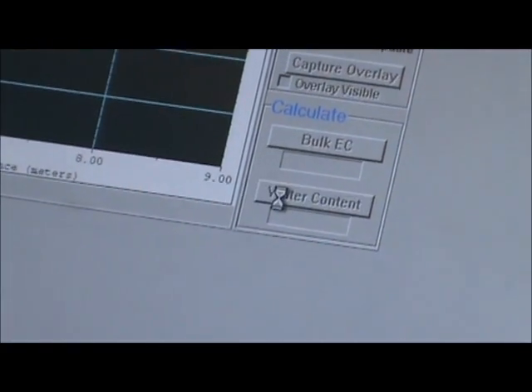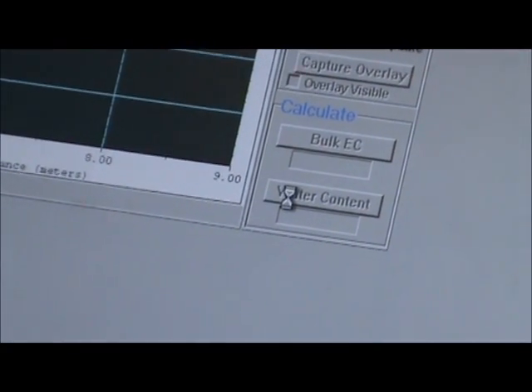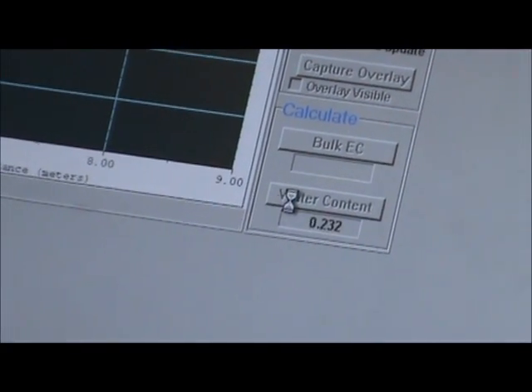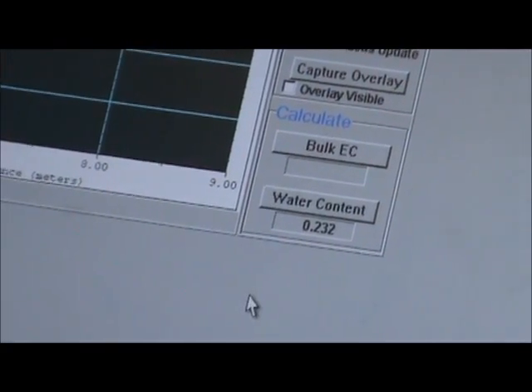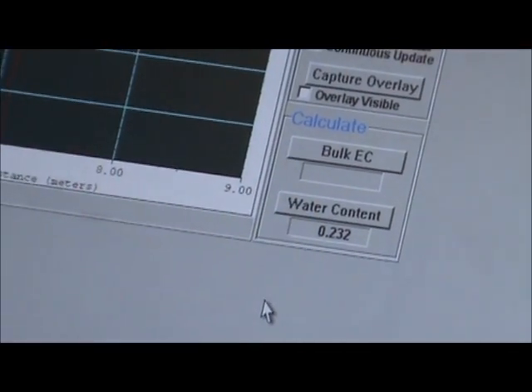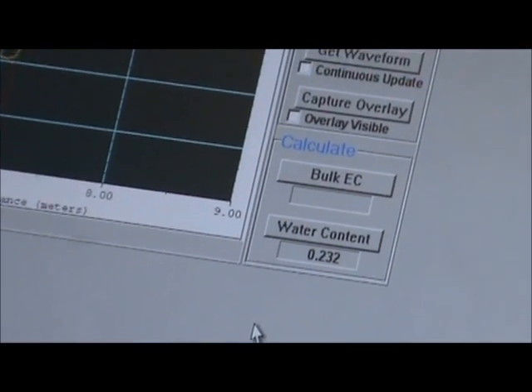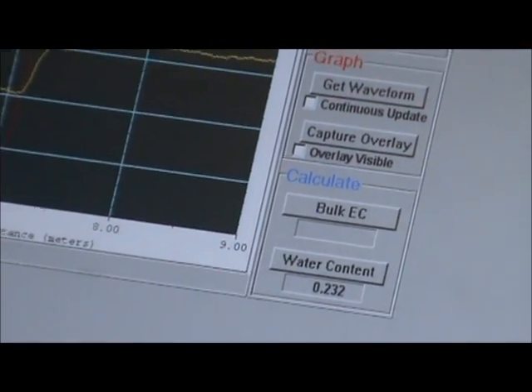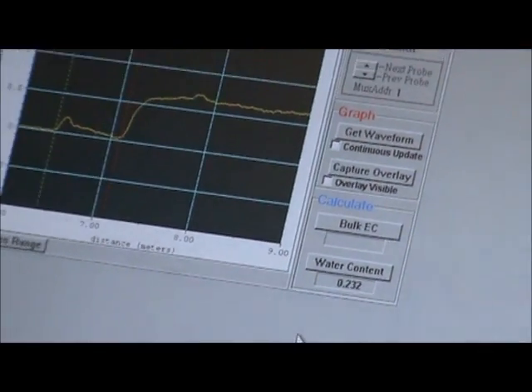We'll go down here, click water content, and it'll give us our water content, 0.232, for the TDR that's deepest in the sand.